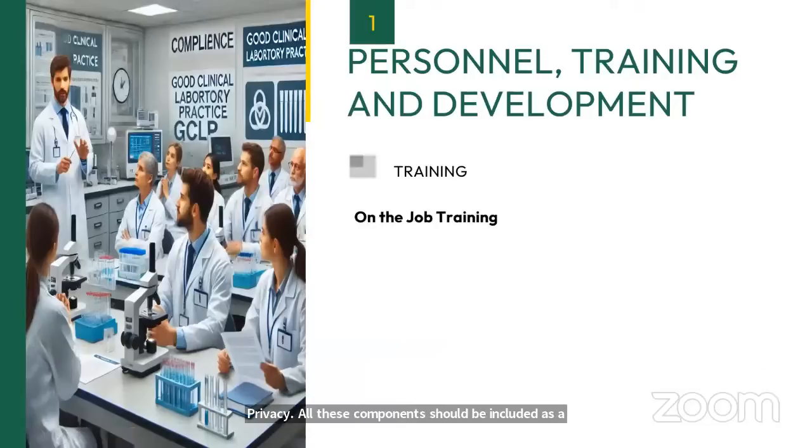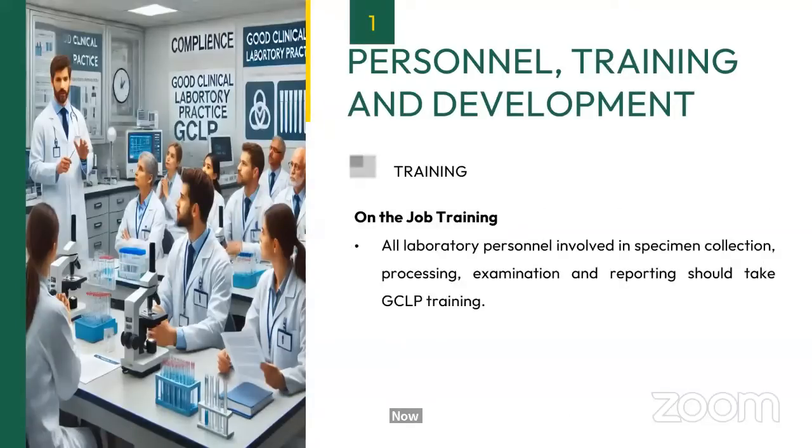Now, after induction training, there is on-the-job training. So basically, it is a continuous training. All laboratory personnel involved in specimen collection, processing, examination, and reporting should take GCLP training. This is given in the document itself. This is not something I have put in this presentation on my own; these same lines are in your GCLP document.